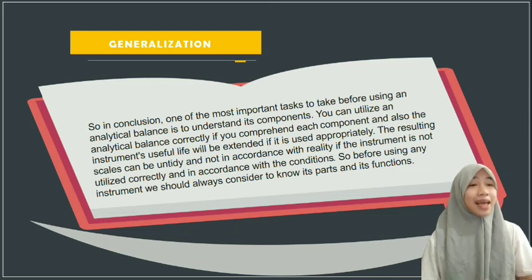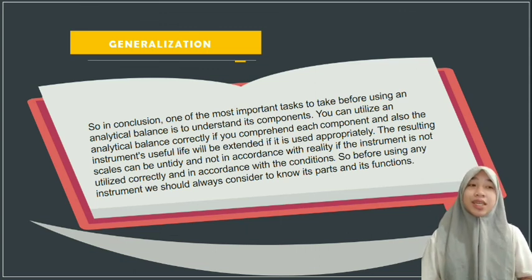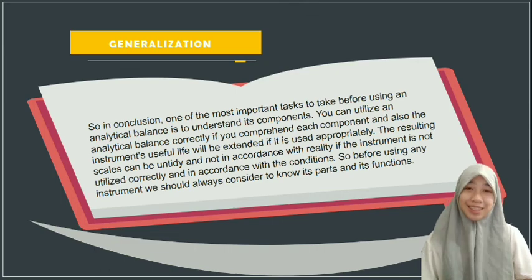The resulting measurements can be untidy and not in accordance with reality if the instrument is not utilized correctly and in accordance with the conditions. So before using any instrument, we should always consider knowing its parts and its functions.